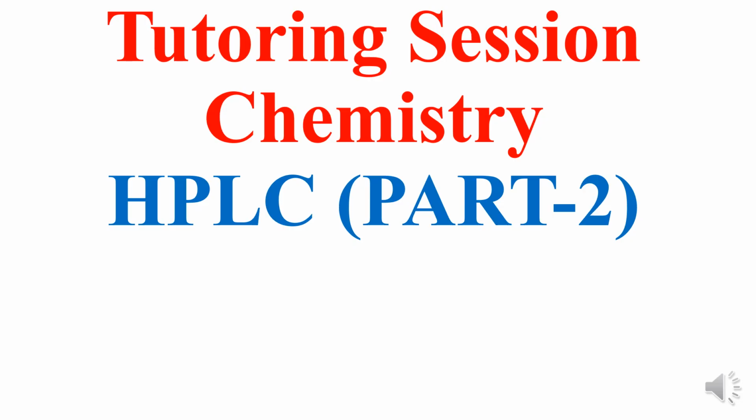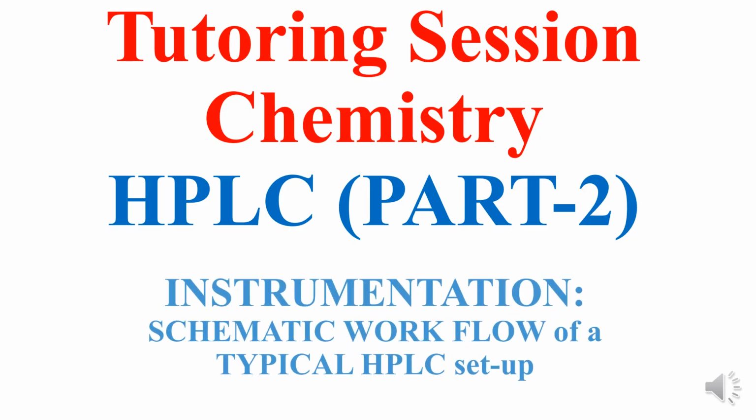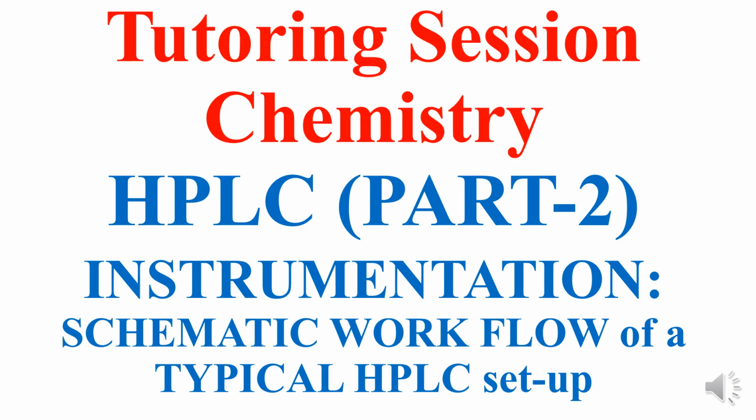The current video is part 2 of the 7-part series in HPLC. In this video, I'll explain the general features of instrumentation in HPLC with a schematic workflow of a typical HPLC setup.